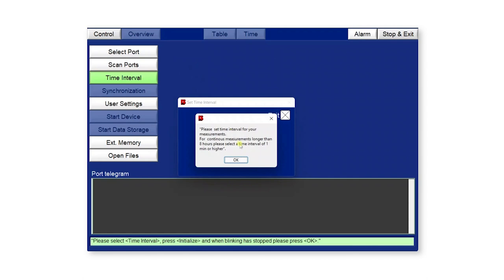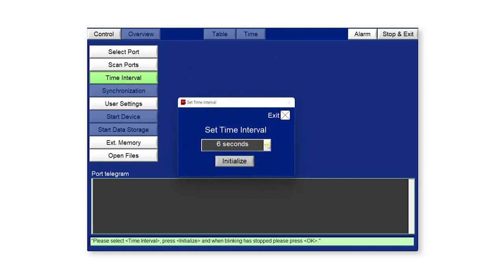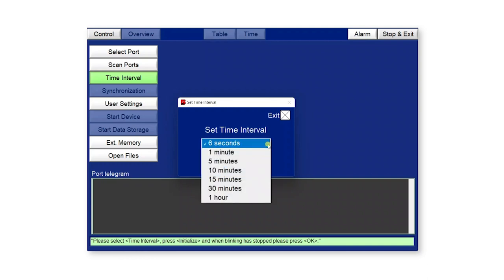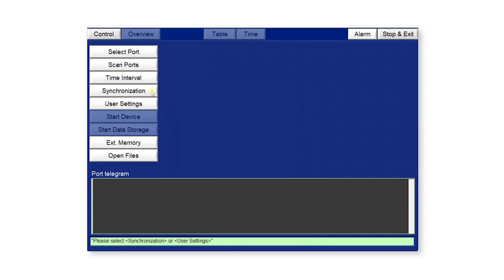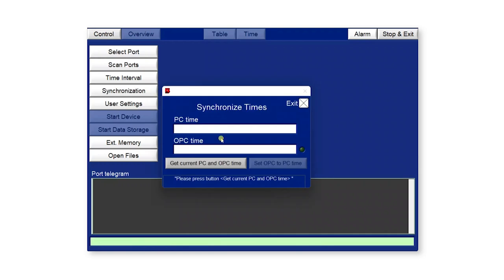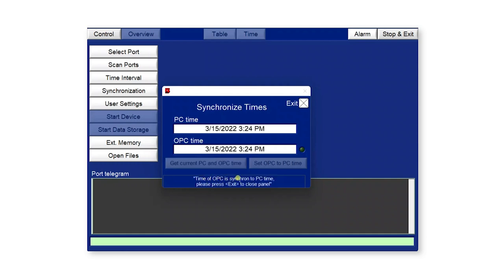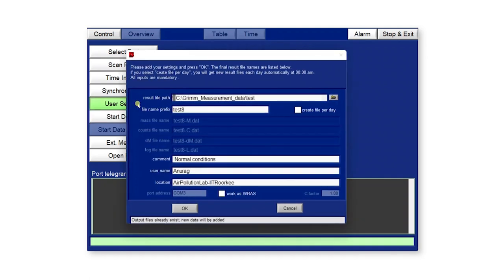Next, set the time interval. The range varies from 6 seconds to 60 minutes. Right now selecting 6 seconds — as per requirements, any option can be selected. Click initialize and the time interval is set, then click exit. Now sync the time of the optical particle counter with your PC time. You can see the current PC time and OPC time displayed. After syncing, the message 'time on OPC is synchronized with your PC time' appears. Click exit.